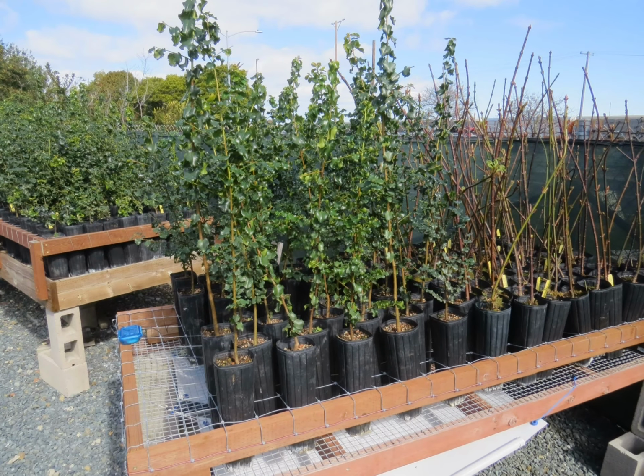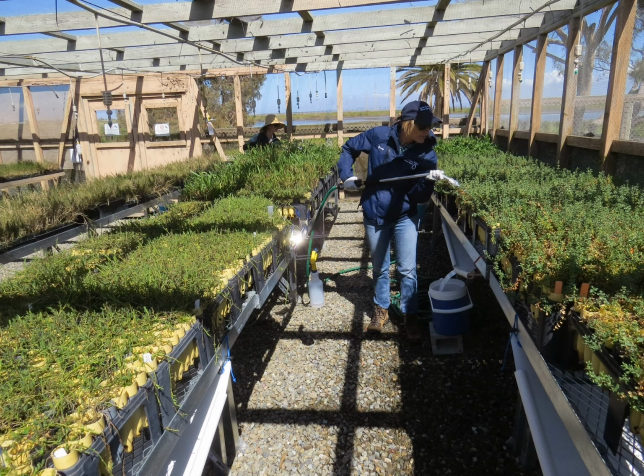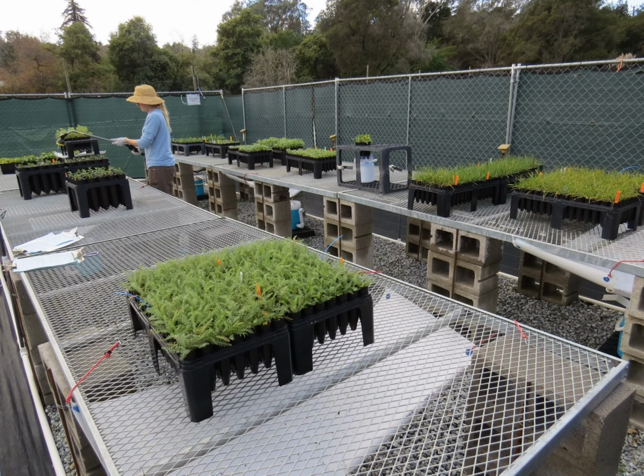So we've been able to take this system and try it in lots of different nurseries under lots of different types of benches and different sizes of stock. You can adapt it to all sorts of different systems. You can either use the plants in place, or you can clear some benches off and set up an area for testing. Sometimes that's much more convenient or efficient.